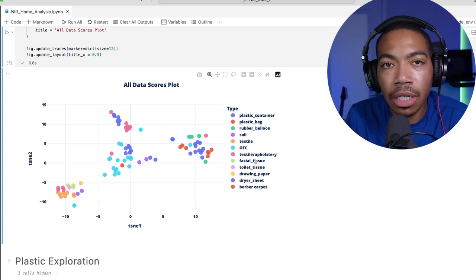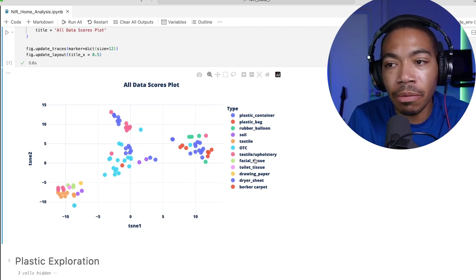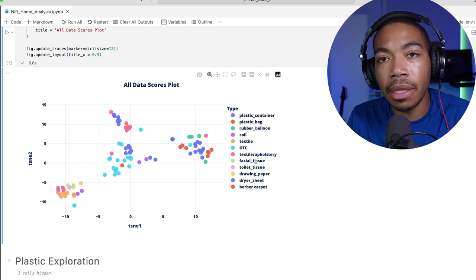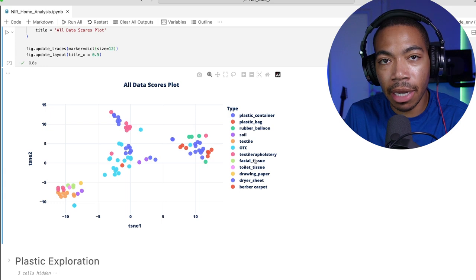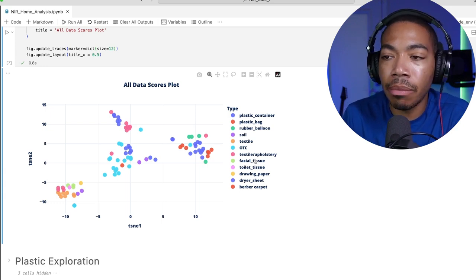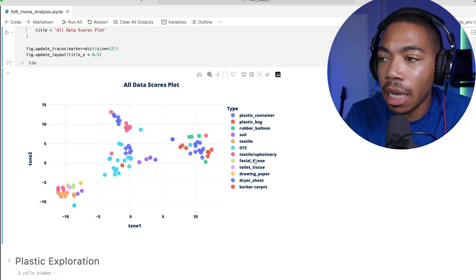As well, I will try to figure out what type of outdoor samples make sense to include, maybe the physical soil around the home, some of the flowers that, if I dry them out, maybe I can get rid of some of that water peak that I've seen in previous testing. But in any case, I want to focus on this soil here.